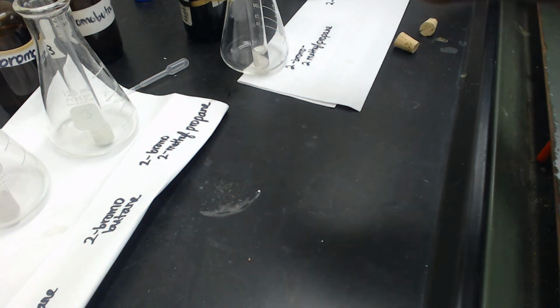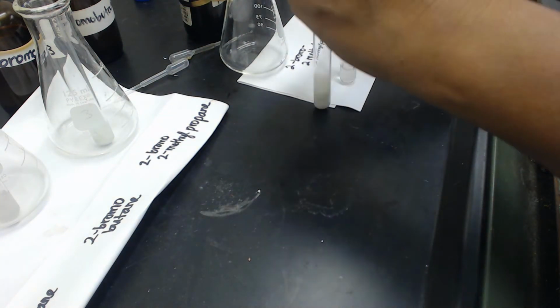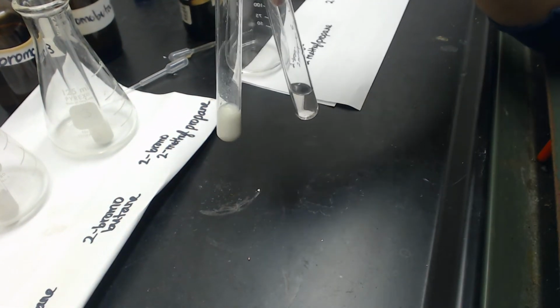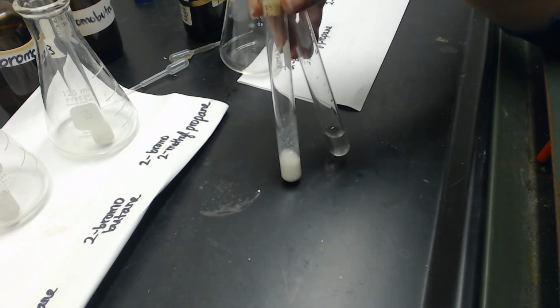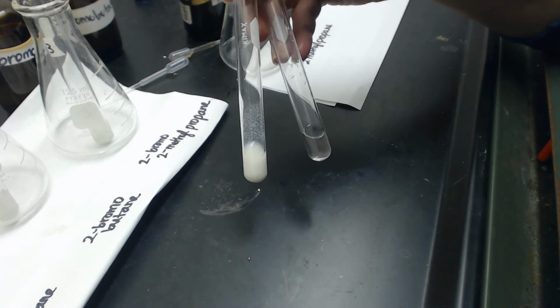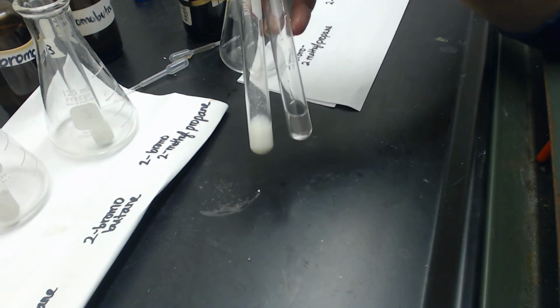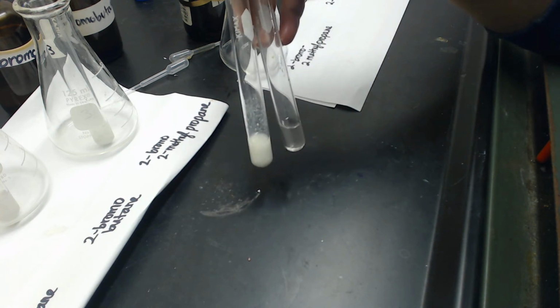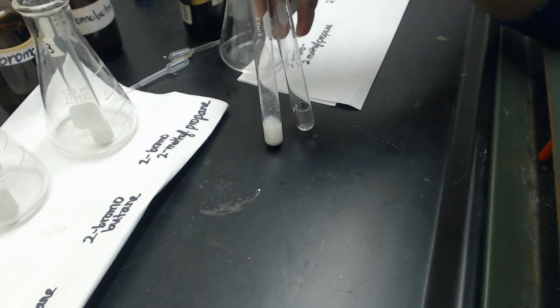All right, I'm just adding about a drop. I'm going to cover them. The bromo compound, I don't know if you could see that in the camera, immediately turned cloudy. The 2-chloro-2-methylpropane has yet to turn. So the 2-bromo-2-methylpropane turned very quickly, and the 2-chloro-2-methylpropane did not. So again, I think we saw this in the last part, that bromine is definitely a better leaving group than chlorine.